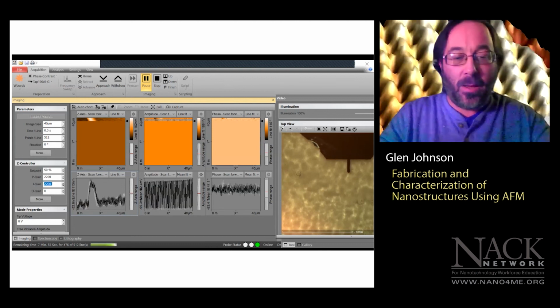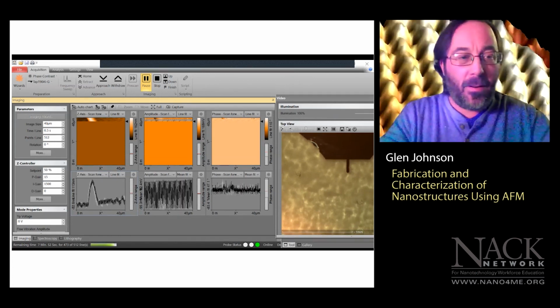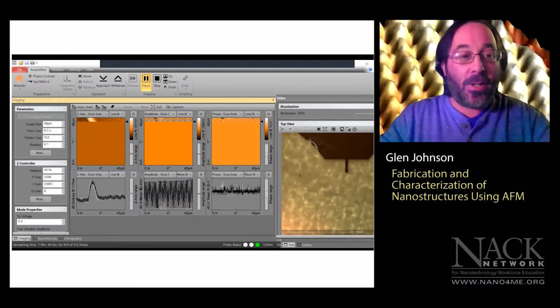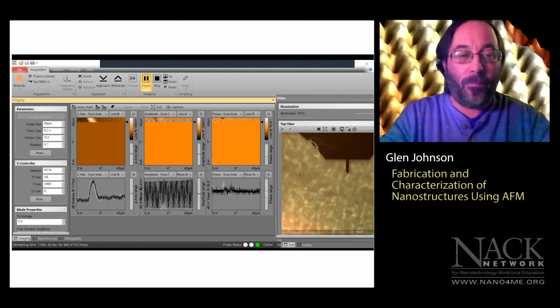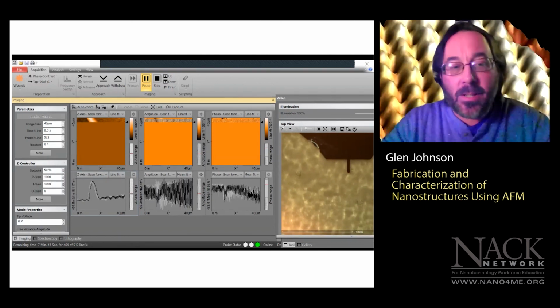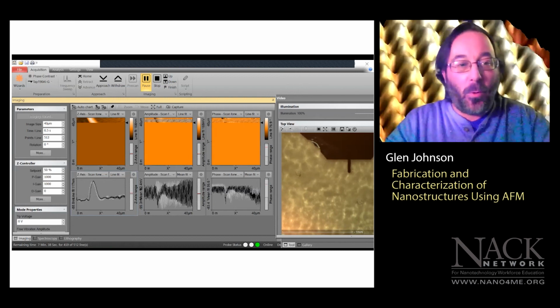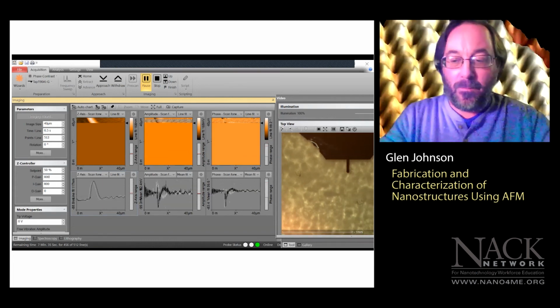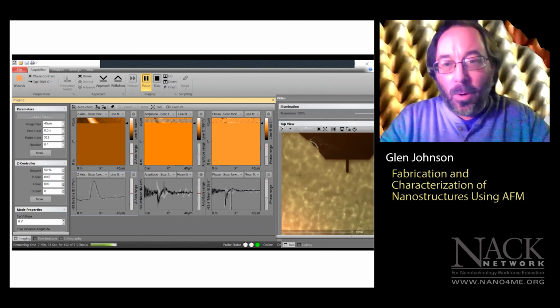And to do that, I simply start lowering it. Change the I first and then the P to match. And it got a little better. And I just continue to do that until I get to something satisfactory. So even at 1000, I brought it down here. It's still a little jagged here. I can still see a little bit of noise. So I want to continue to lower that until I've eliminated all that. So now the noise is gone, or looks like it's gone.